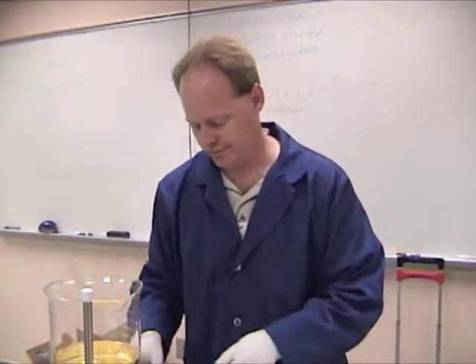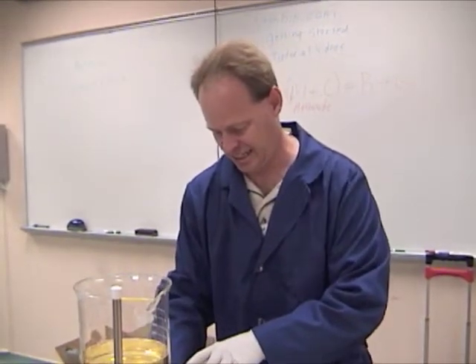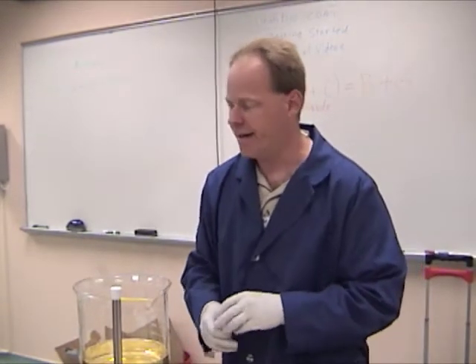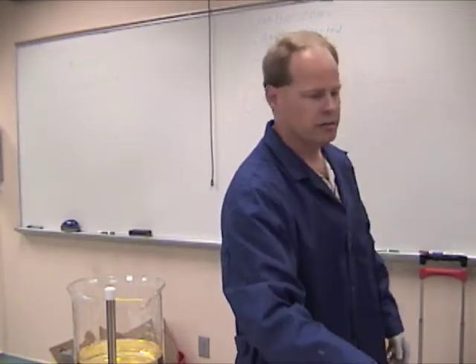This will work by the advantage of using potassium over sodium as it dissolves quicker. Yeah, it's going to dissolve a lot quicker. There's some safety problems.